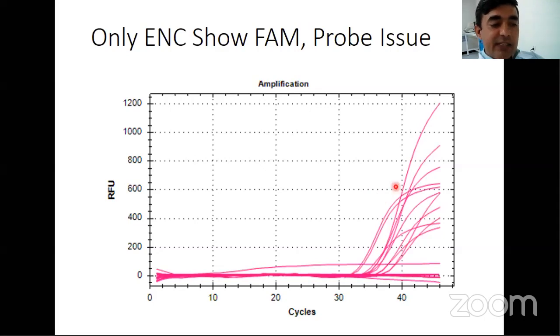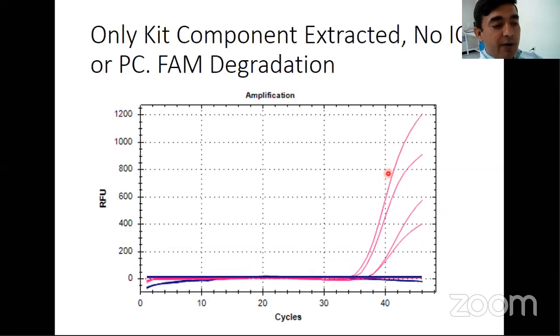So why is this probe breakage appearing? Many reasons can be behind this probe breakage issue. It can be a shipment issue, or not a proper probe preparation from the company, or exposure to a very strong light. The probe can be broken down, or some other phenomena or contamination process may appear, so the probe may be broken down.